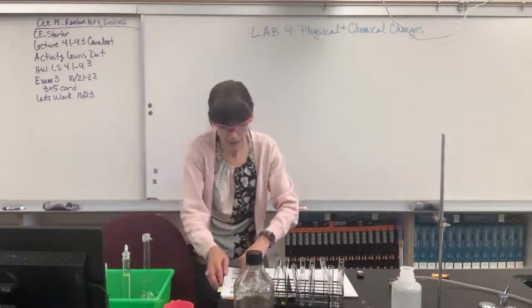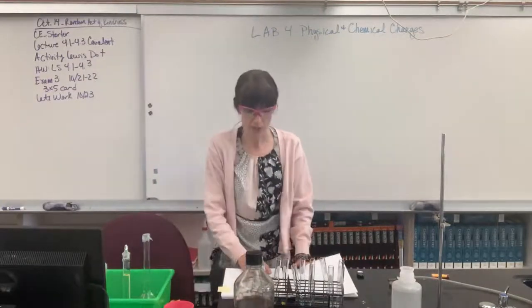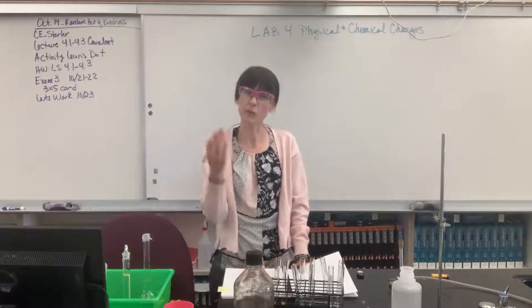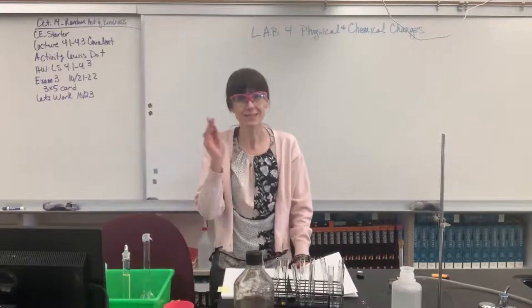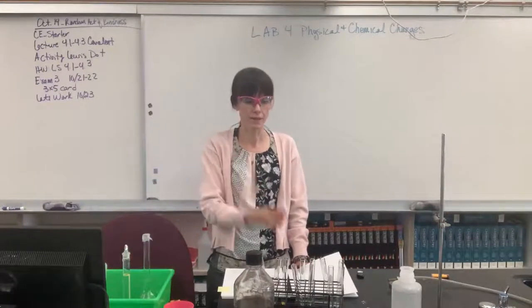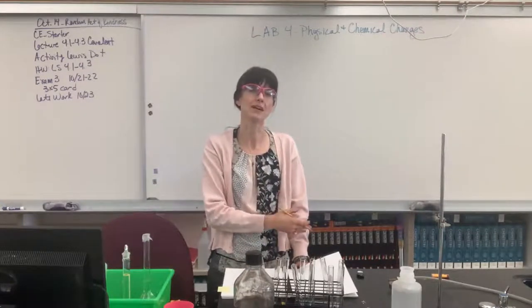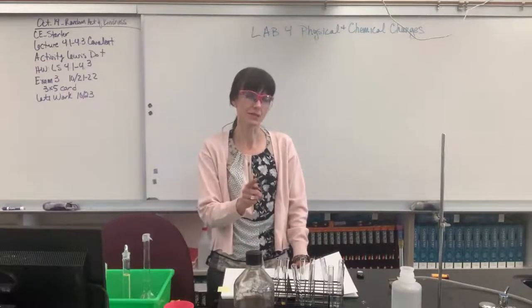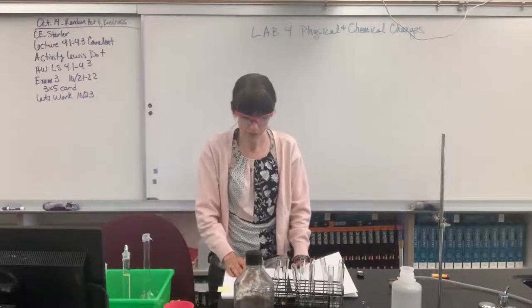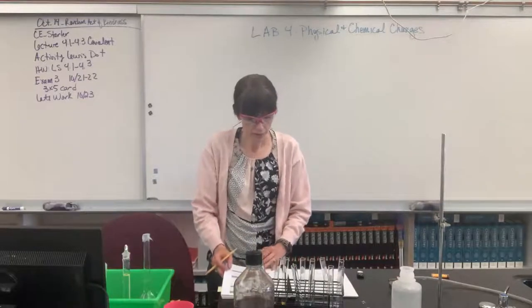We are going to have on page 53, where it says result of adding silver nitrate from the recovered solid, it's also white. Which tells us, is another confirmation, that that was sodium chloride. It underwent a physical change. It didn't chemically change when I dissolved it in water. Okay, good. So now we're going to go to part B.